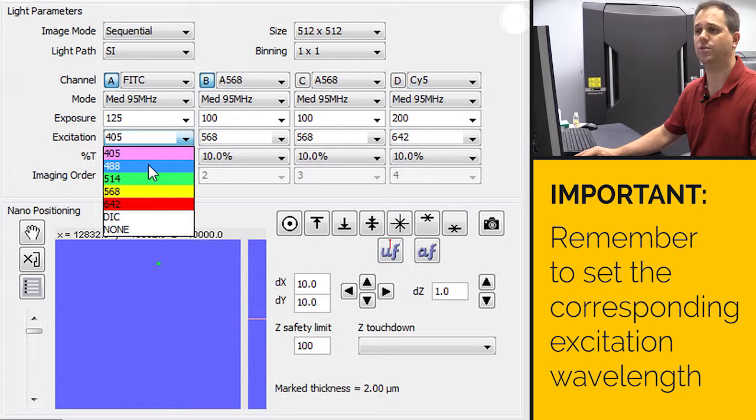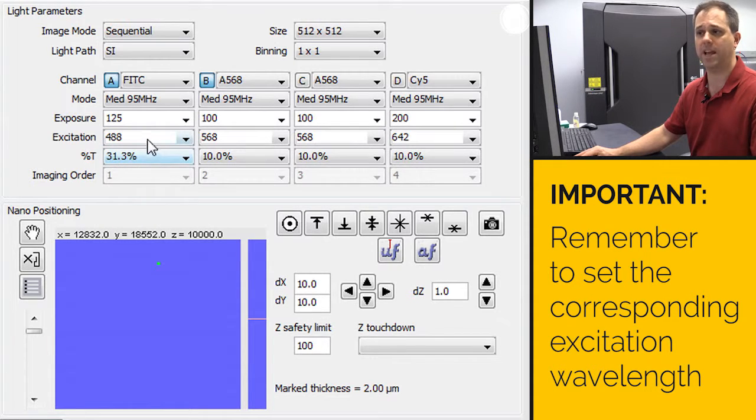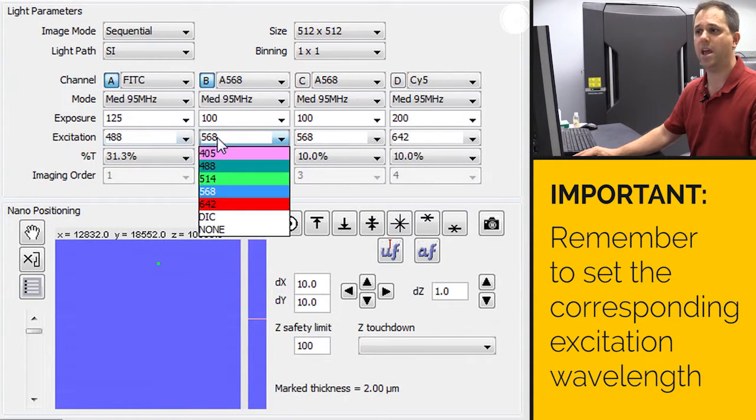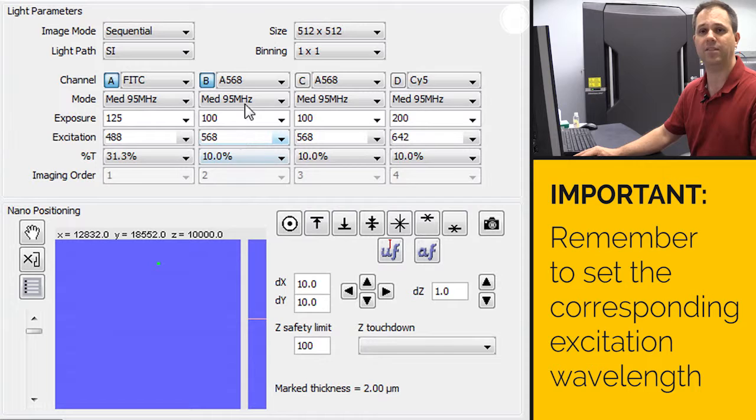So the excitation for fitzy or green is going to be the 488 laser, and for alexa 568, it will be the 568 laser.